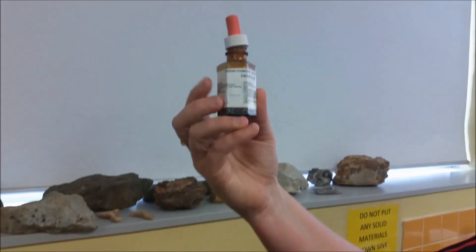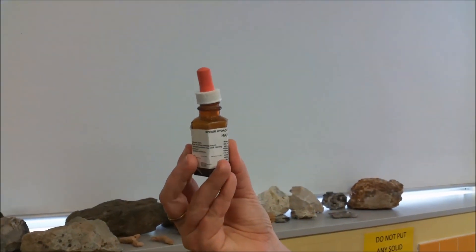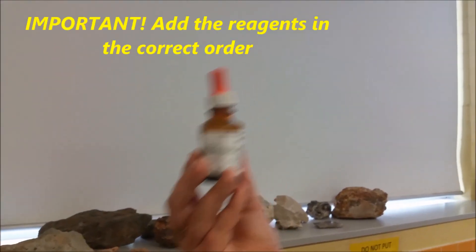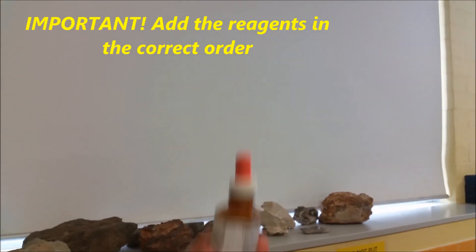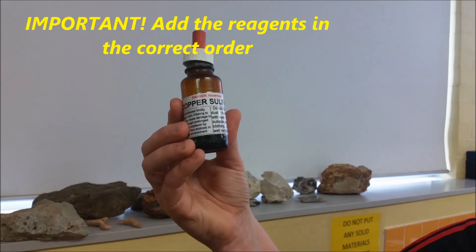The first step is you need to add one pipette full of sodium hydroxide. Now it's really important because you've got to add two reagents in this case, that you make sure you get one of each bottle. They are labeled sodium hydroxide, the other reagent is copper sulphate.